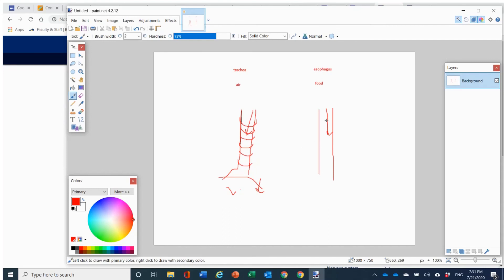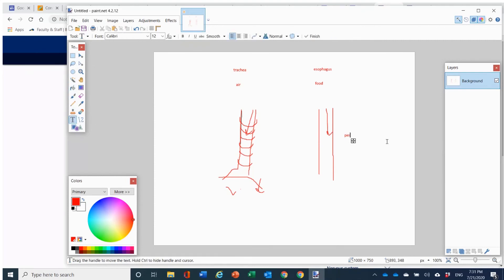On the other hand, the esophagus brings food down with what's called peristaltic movement. The esophagus has to be soft — it's muscular, but it can collapse in its entirety. Basically, if you've ever milked a cow, that's essentially the kind of movement that your esophagus makes. It contracts in waves, thereby moving the food down into your stomach. And that's basically the gist between the trachea and the esophagus — that's what I want you to understand.